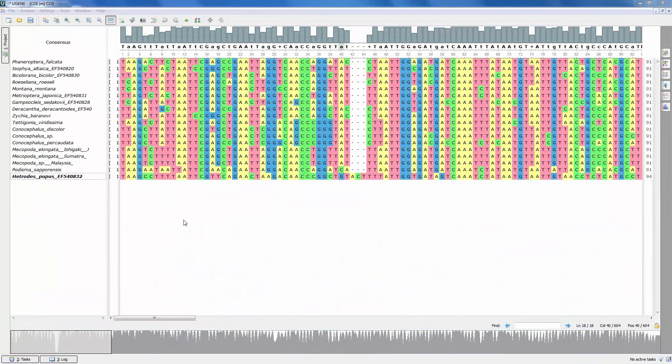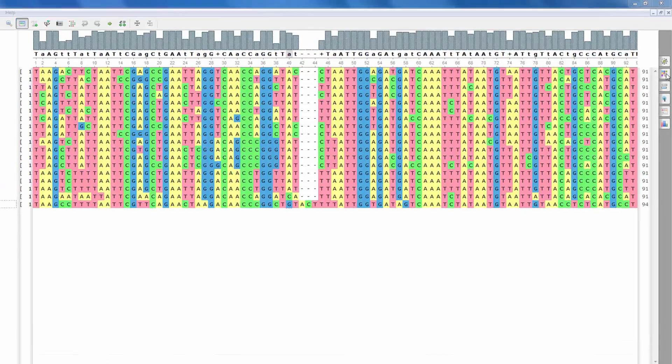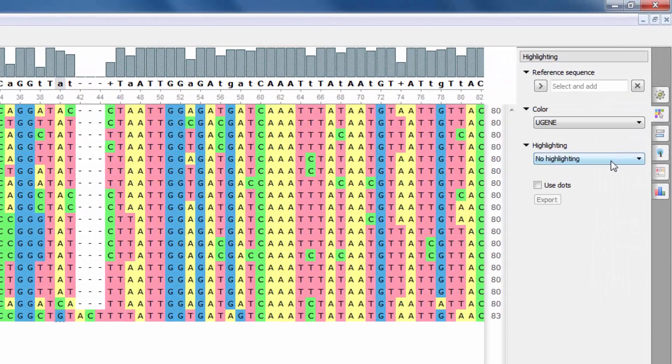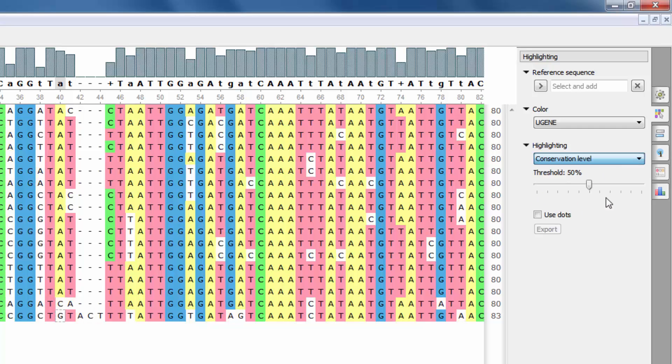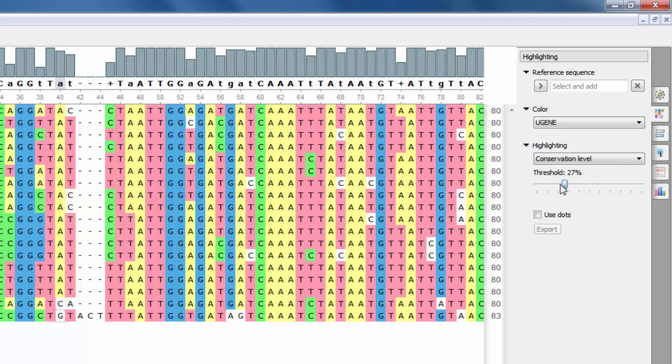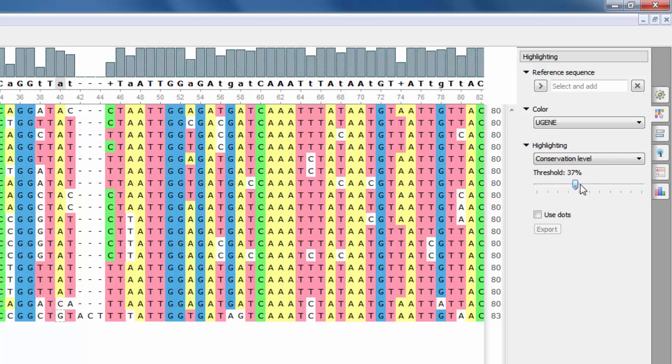A new modification in the alignment editor is a new type of highlighting based on the conservation level. If you choose this type of highlighting, then nucleotides or amino acids are highlighted only if their amount in a column is greater than the threshold.